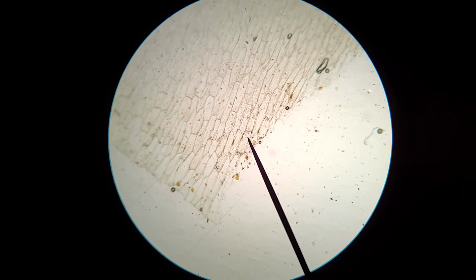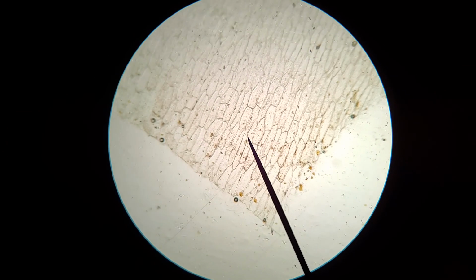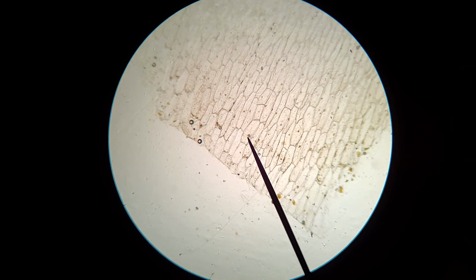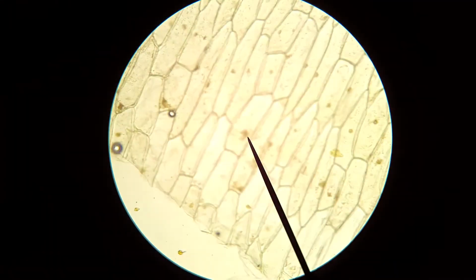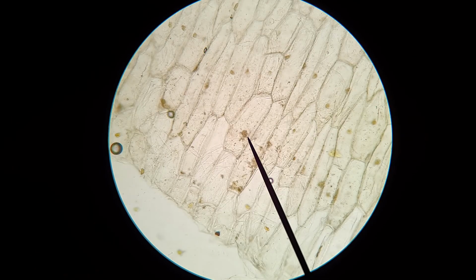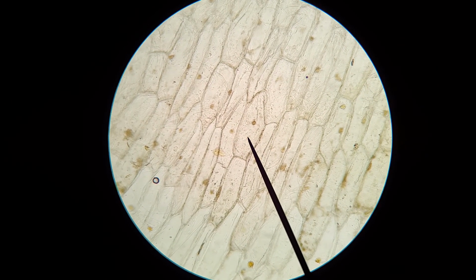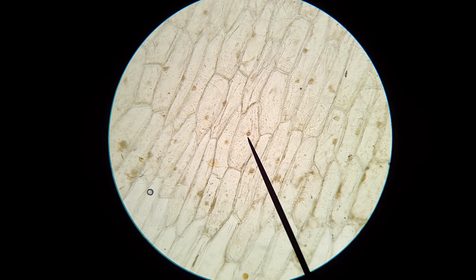Now we can increase our magnification if it suits our purposes. Make sure you put your cell in the center of the field of view so it will remain centered when you increase the magnification. As you can see, our onion is clearly made up of many small cells, just like cell theory predicts.